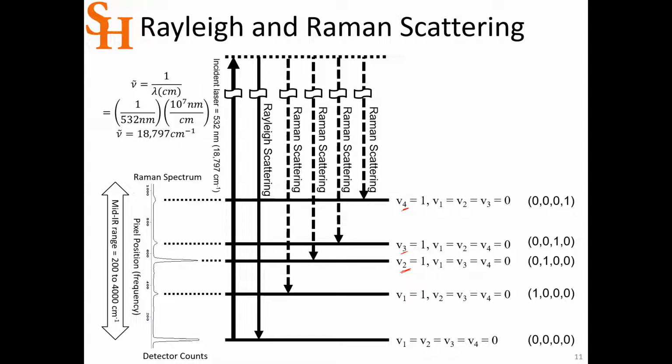So I picked the easiest ones, but even then it's a little tricky, because if you just go by frequency, Gaussian will give you some of the ordering of these peaks, but some of them are jammed pretty close to each other. So you're going to also want to use the intensity that Gaussian predicts, because you'll have a big peak in the spectrum, and if you sort them in order, that might be a really short peak in the Gaussian output, but right next to it is a Gaussian peak with a really big intensity. So it's probably not just sorted high to low, the right assignment.